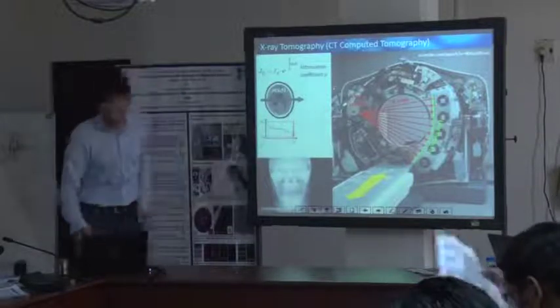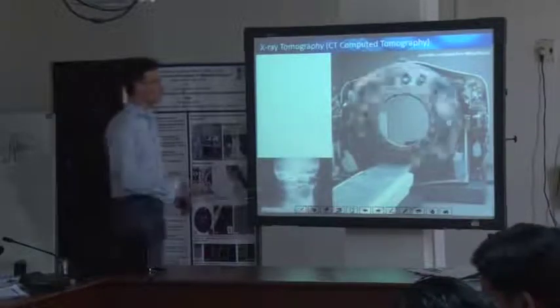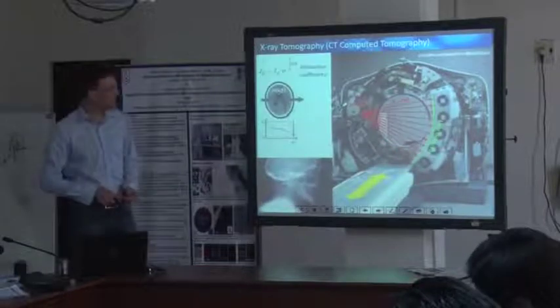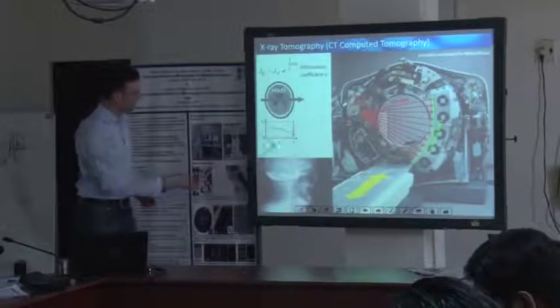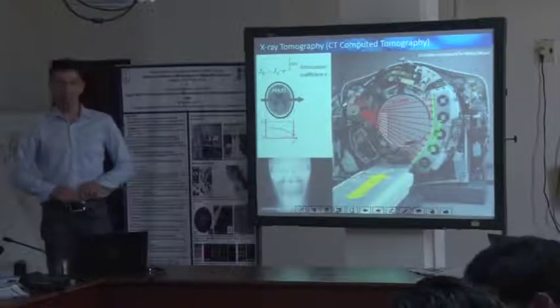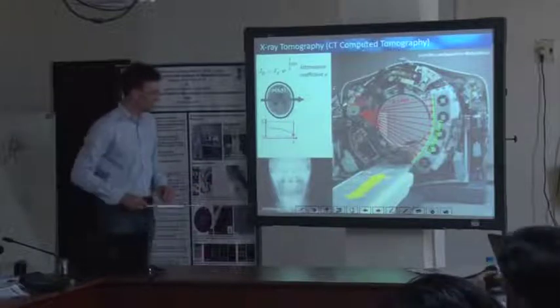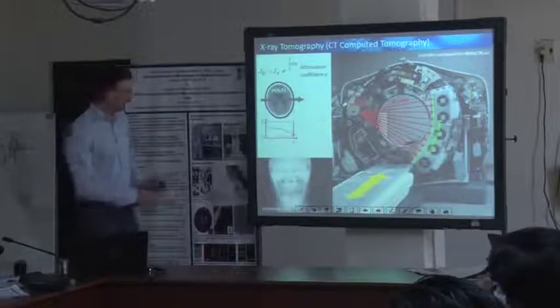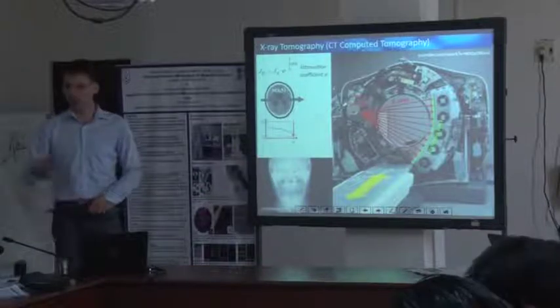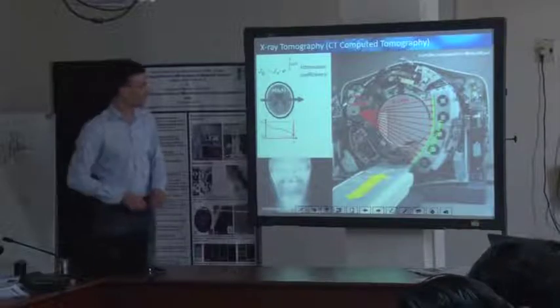What you can see here, let me just restart the video, is the rotating part that makes quite some noise in the tool. Here you see a series of projections in different directions. This is just the skull of a human. In principle, there are different grayscale values, depending on the imaging mode. In the TEM, you will see that it's far more complicated than in X-ray tomography.